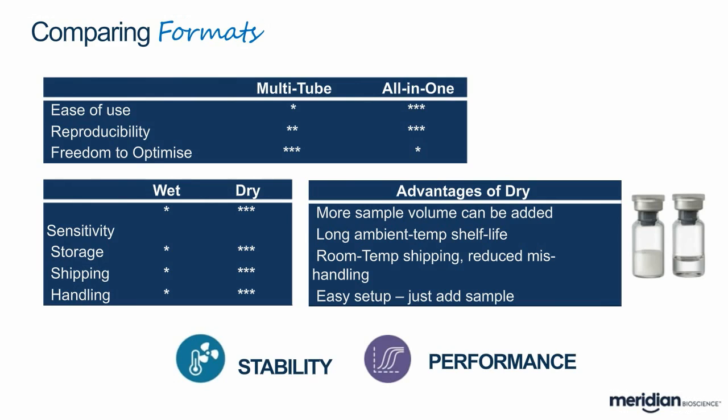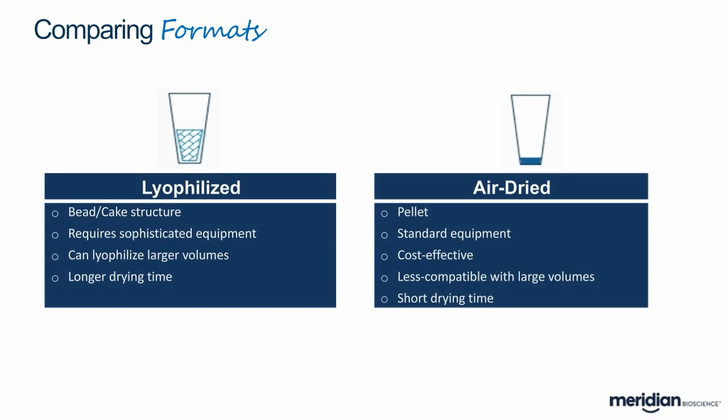We recommend that you choose the format that will provide the stability and performance that your assay requires. I'd like to expand a little more on dried formats and compare lyophilized and air-dried. The two formats contrast in their appearance, cost, workflow, and applications. Lyophilization offers the freedom to dry down larger volumes, meanwhile air drying has a shorter drying time and can be done with standard equipment.